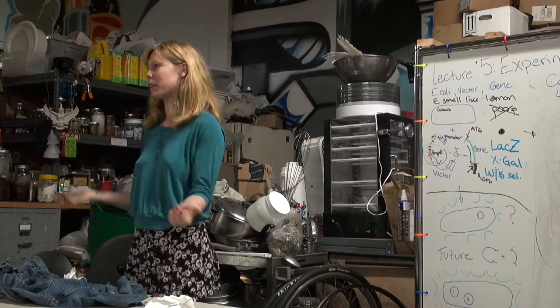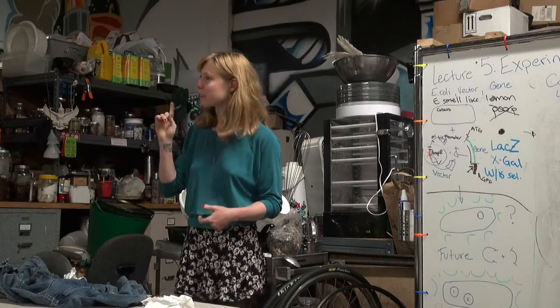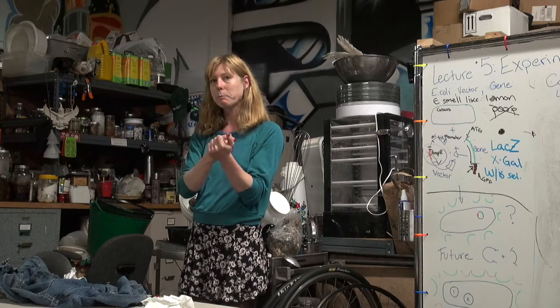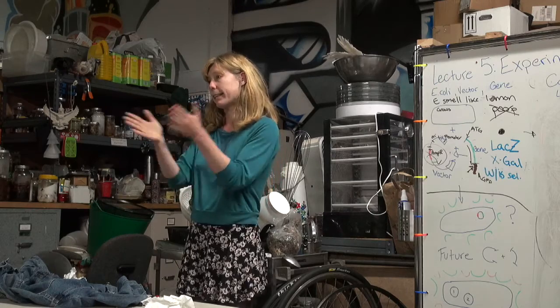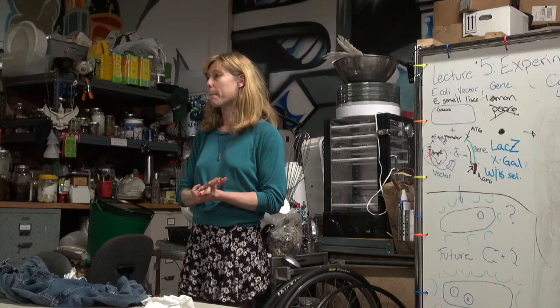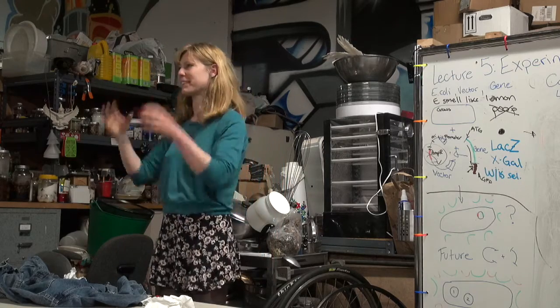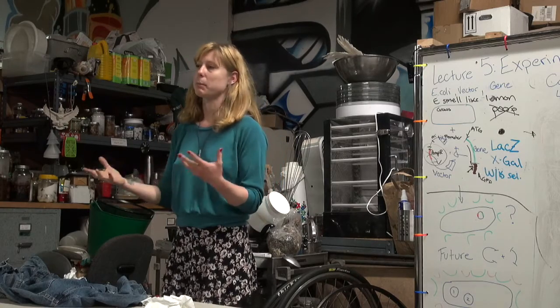For instance, when we were doing the mini prep class, when we were extracting plasmid, I forgot to tell you guys for the very first step that you need to resuspend the cells. Now, that could have affected our yield. That could have affected how much plasmid we got. We still got some, but not as much. It could have also affected whether we got plasmid at all. It also could have affected the quality of the plasmid that we got. We could have harmed the process somehow. And so the first check is, how much plasmid did we get?